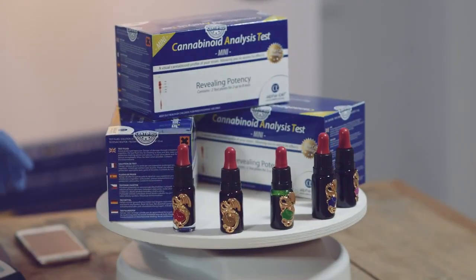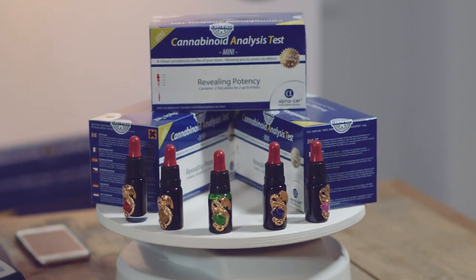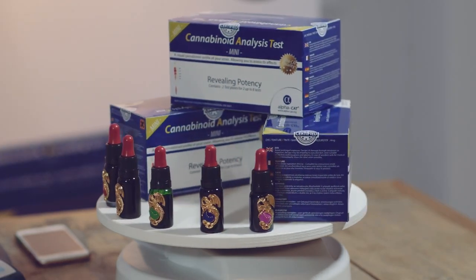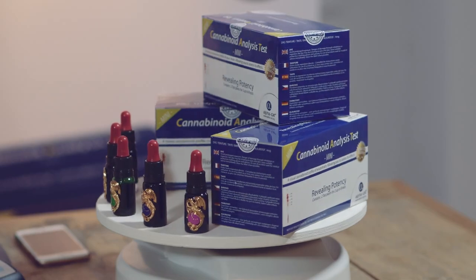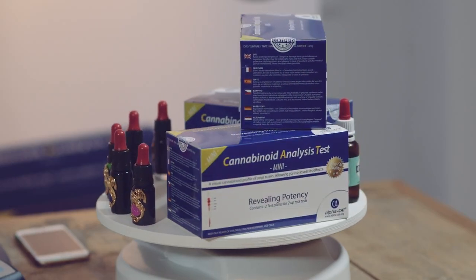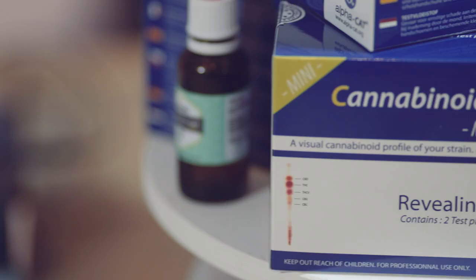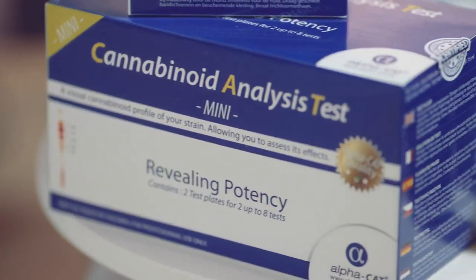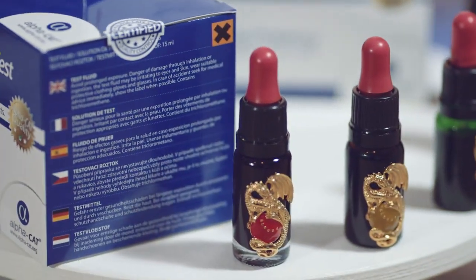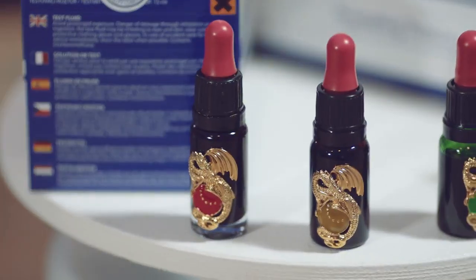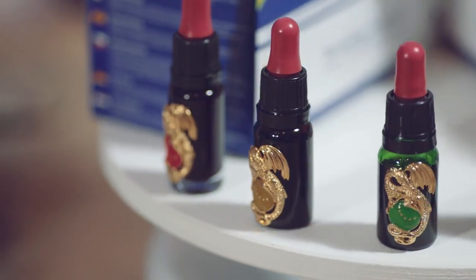The Alphacat uses an established method to test quantitative percentages within plus or minus 2% of CBD, THC, THCV, CBG, and CBC. It also analyzes acidic counterparts such as THCA and CBDA, which provide insight into a sample's age and quality.